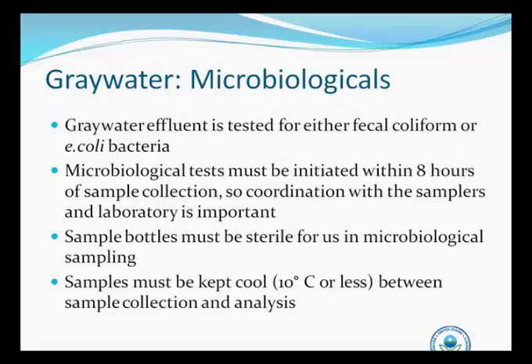So if microbiological testing is going to be performed on gray water, it's likely going to be a test for either fecal coliform or E. coli bacteria. These particular parameters have been prone to contamination in the past during sampling activities, so it's important to really be as sterile as possible while you're doing the collection. But these tests have to be initiated within 8 hours of sample collection, so this is where coordination with the samplers and the laboratory is really important.